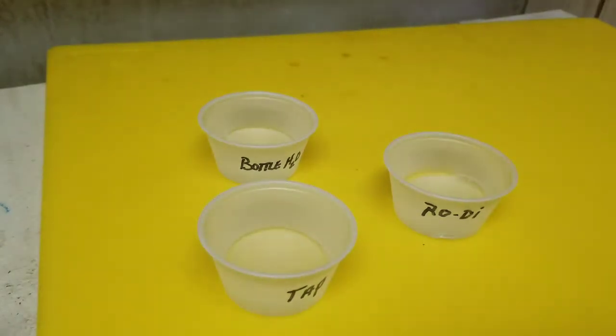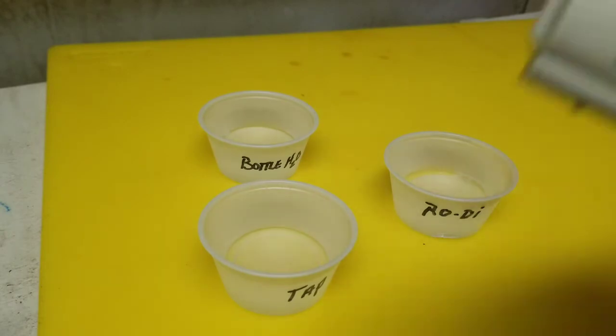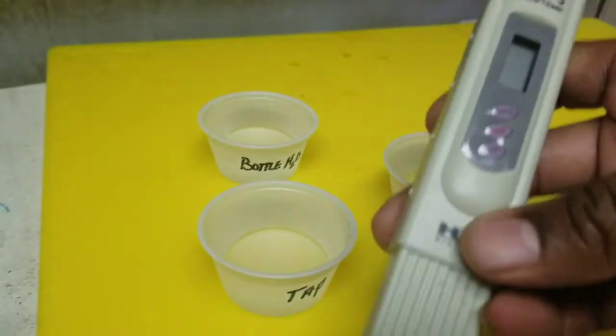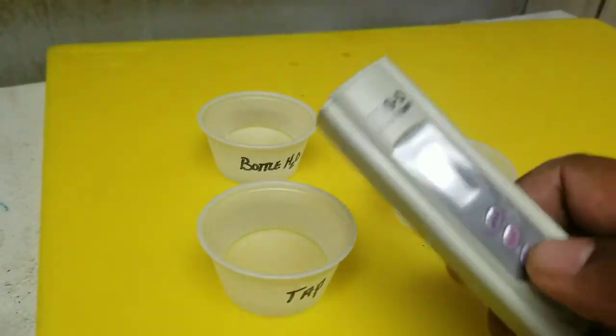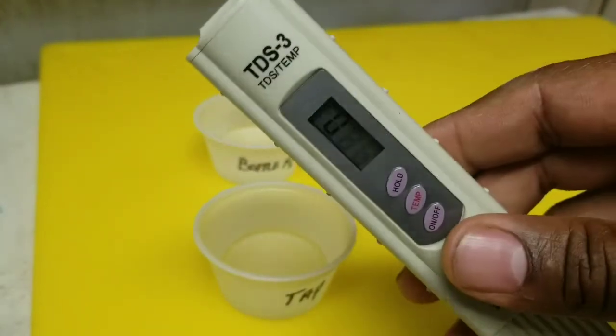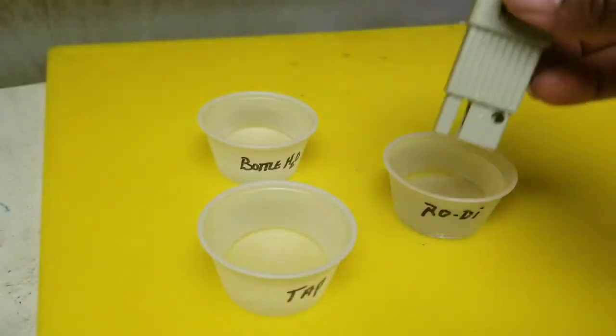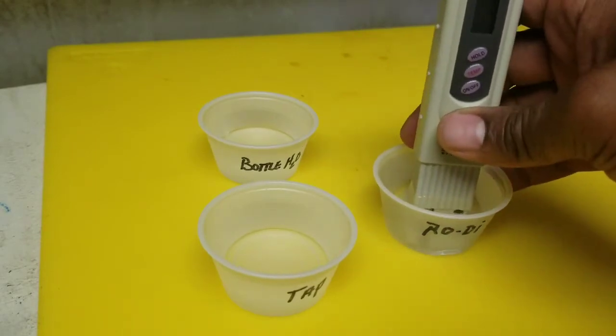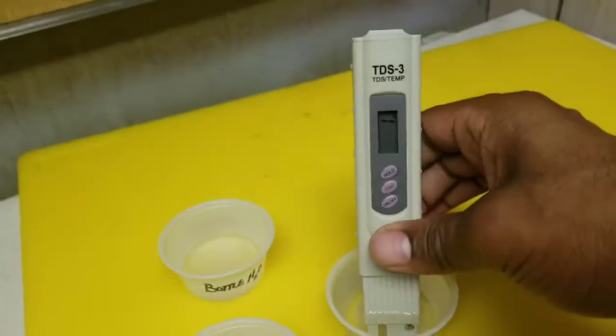Now, with that being said, we'll take our old TDS3 TDS meter, take the cap off, and turn it on. Have a reading of 0. You always want to make sure you're starting with a reading of 0. Let's start by testing the RO water. I'll lift this camera up so you can see.